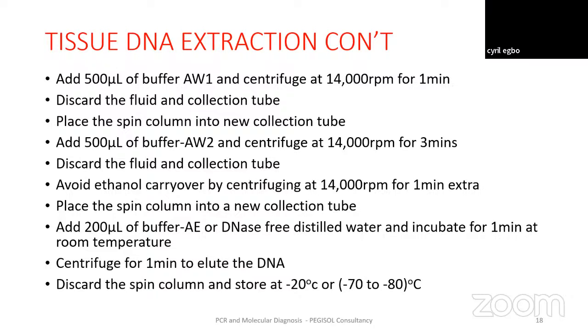If you use a distilled water that contains DNA, then during your amplification process or your PCR process, there may be false positive or false negative results at the end of the day.